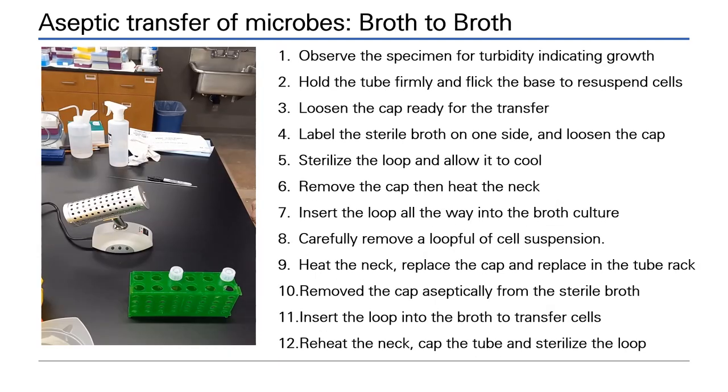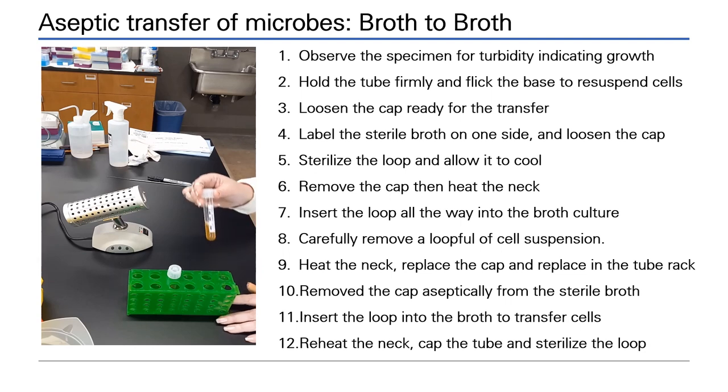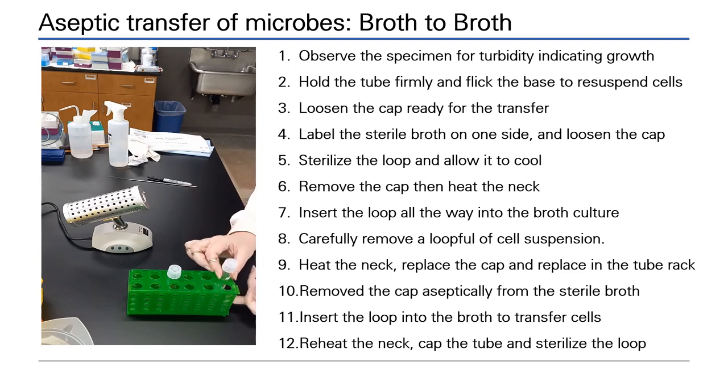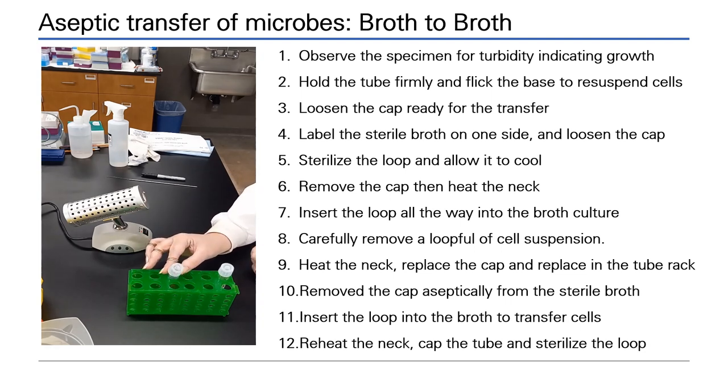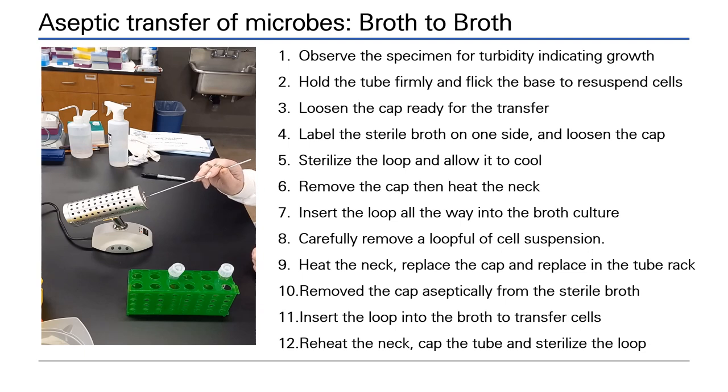Aseptic transfer of a broth culture to a new broth. First, check that your culture has grown and is turbid — the broth will appear cloudy and cells will have settled to the bottom. Hold the tube firmly and flick the base to re-suspend cells. Loosen the cap. Now take your sterile broth for transfer and label it: include the organism name, the date of culture, and your initials. Loosen this cap as well.